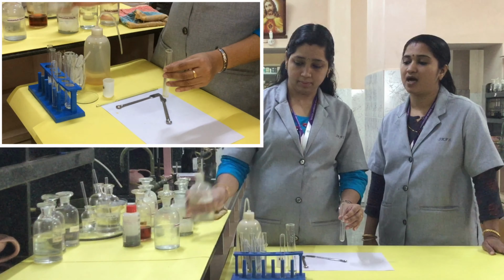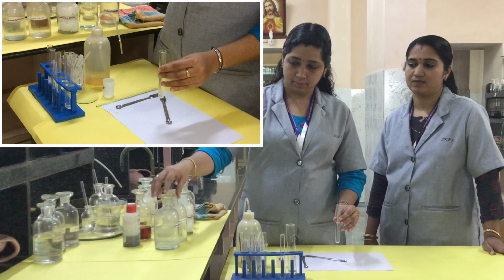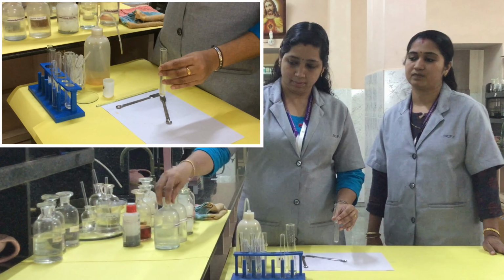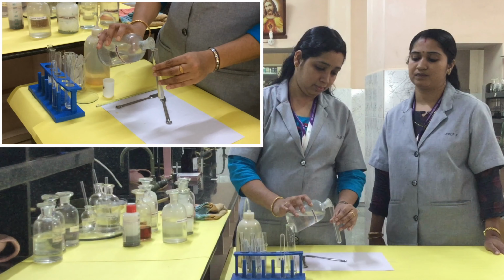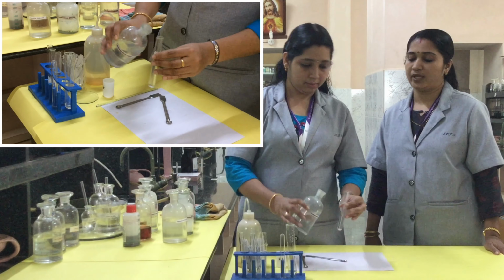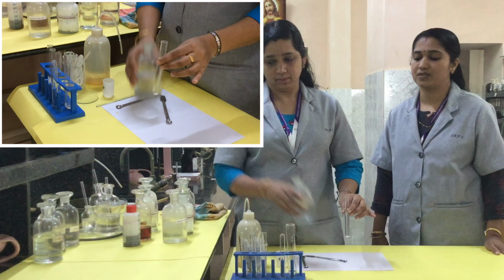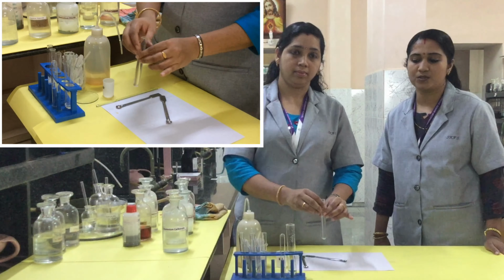The next reagent is ammonium carbonate. Ammonium carbonate is also added. Now just observe the change. There are no residues formed. So group 5 is also absent.